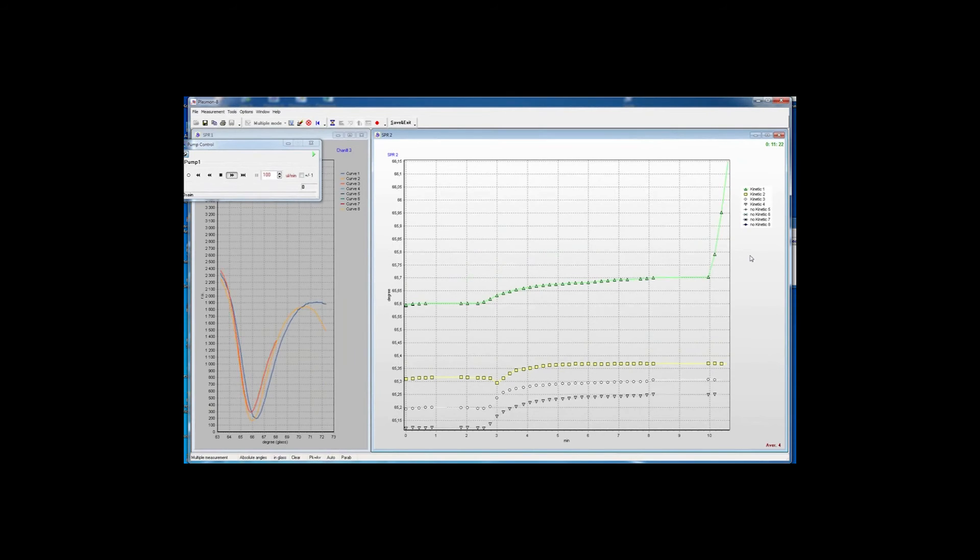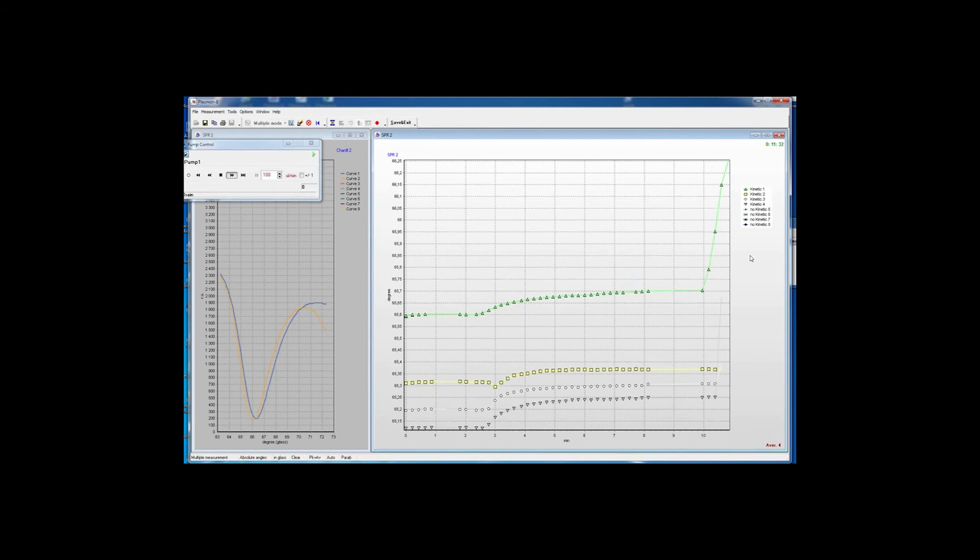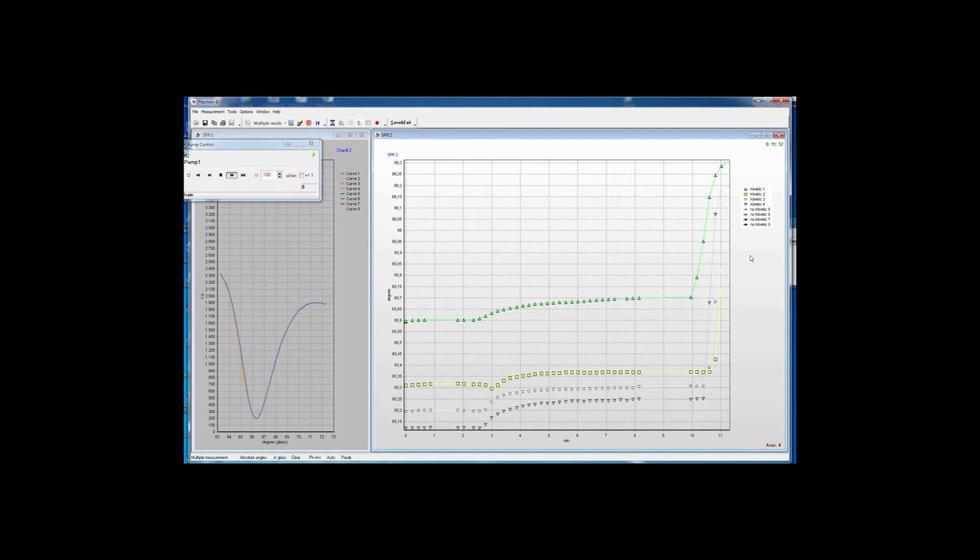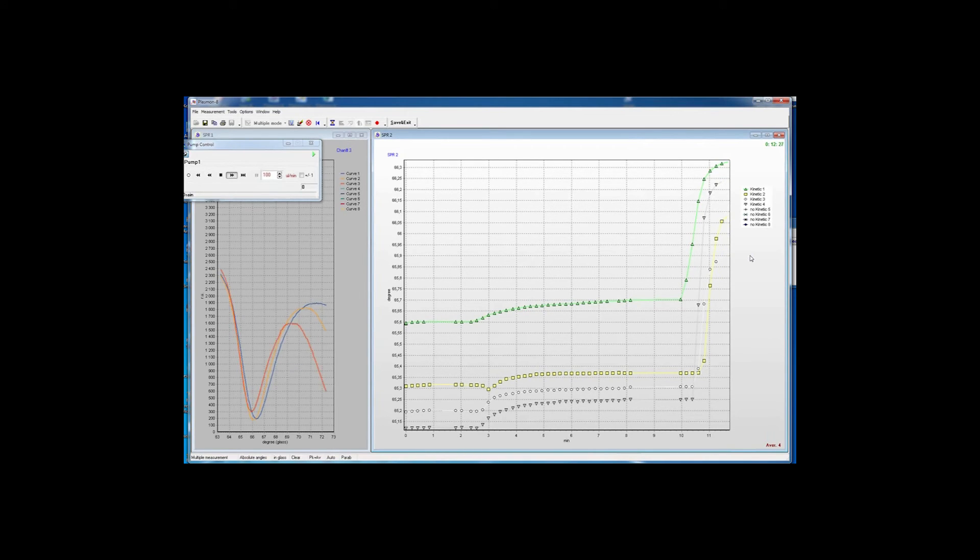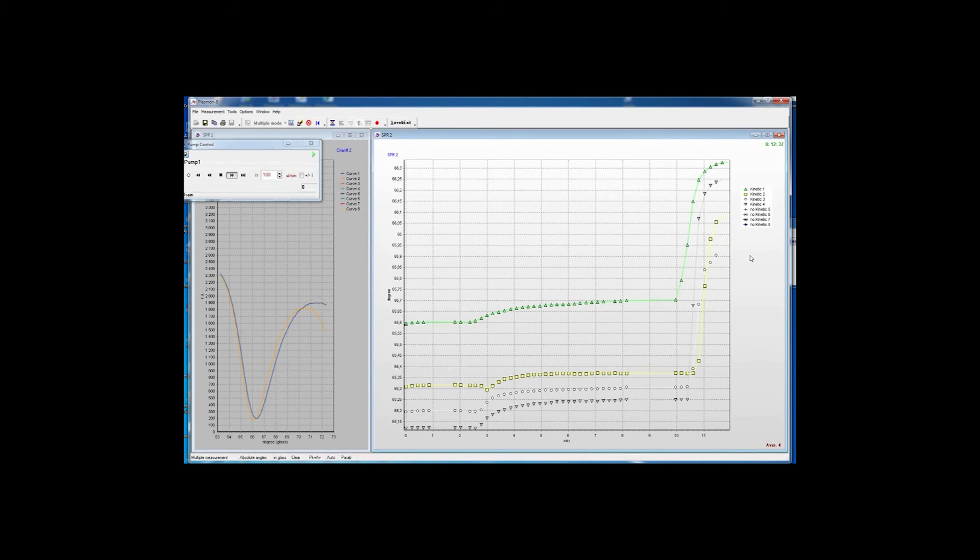For the test experiment, we will inject BSA and anti-BSA into the cuvette. After establishing the baseline in the buffer, we are going to introduce the measurement solution. As a result, the position of minima will shift.